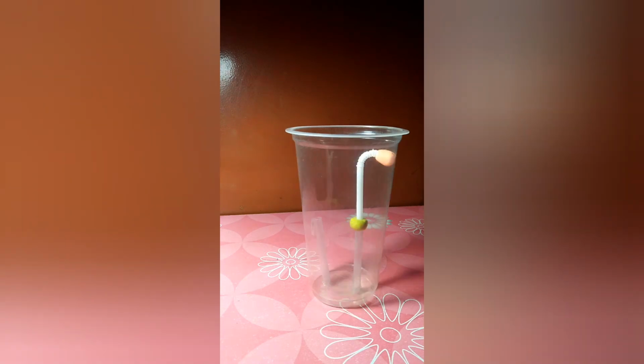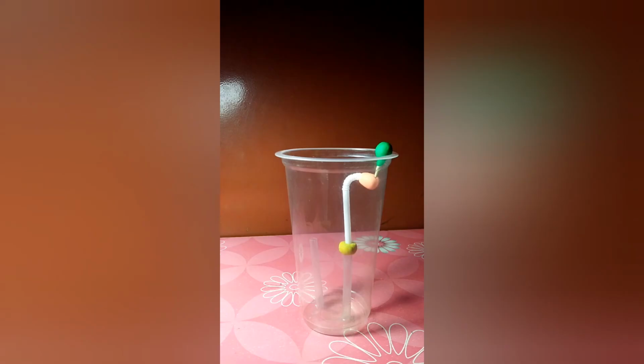After attachment, we add secondary antibody here which is linked with an enzyme, and that's why we call this technique enzyme-linked assay. So the secondary antibody also binds specifically to the antigen at its another epitope. Now we will add the substrate. Enzyme substrate reaction takes place and it will change the color of the solution. And by looking at the color, the amount of the antigen can be depicted.